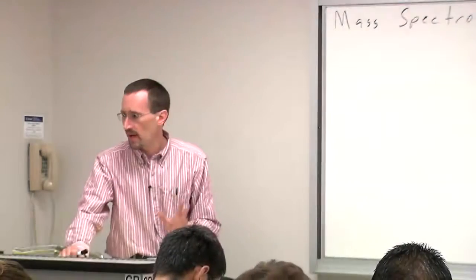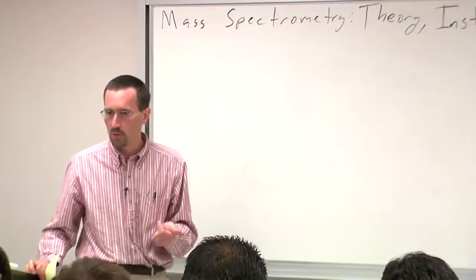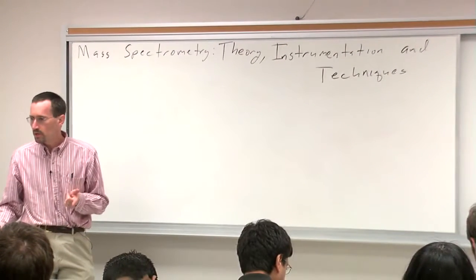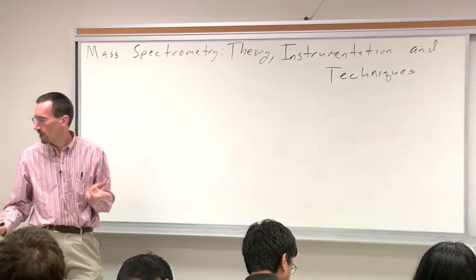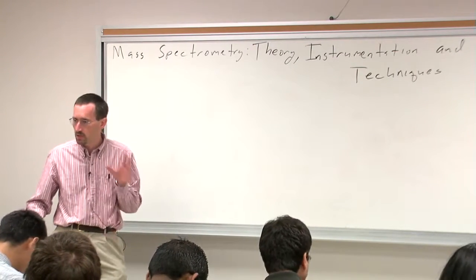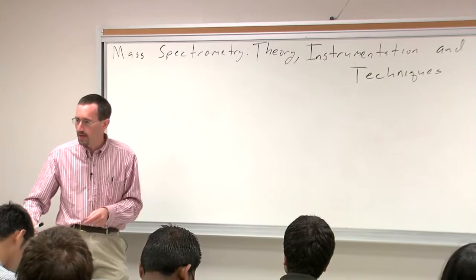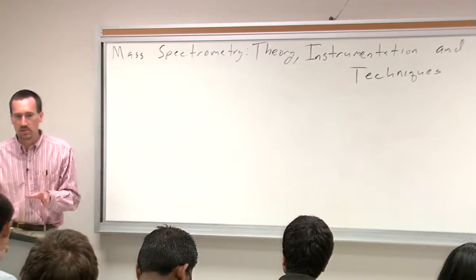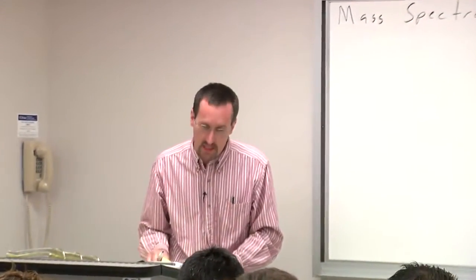To start talking about mass spectrometry, today we're going to talk a little bit about how the technique works. On our next lecture on Monday, we're going to talk about concepts, and then on Wednesday, we'll spend one lecture on EI fragmentation, which is kind of special topics. It used to be really central to mass spectrometry. It's sort of part of pedagogy that's carried on, but EI mass spec is the historical first in mass spectrometry, but is a lot less important these days.